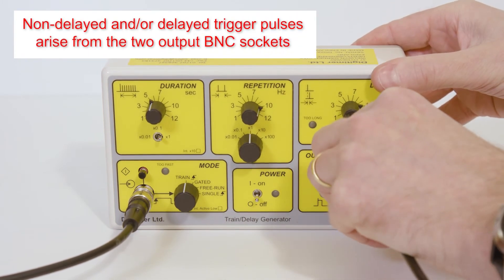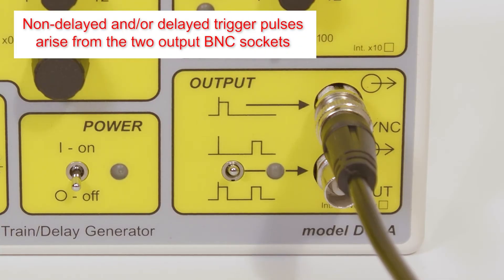Devices to be triggered by the DG2A should be connected using one of the two output BNC sockets. The upper socket gives non-delayed output pulses, while the lower socket can be set using the associated toggle switch to deliver pairs of non-delayed and delayed pulses, or just delayed pulses.